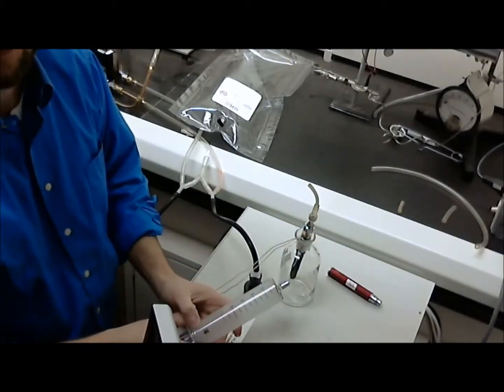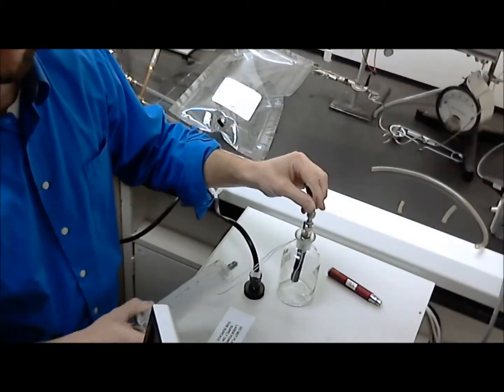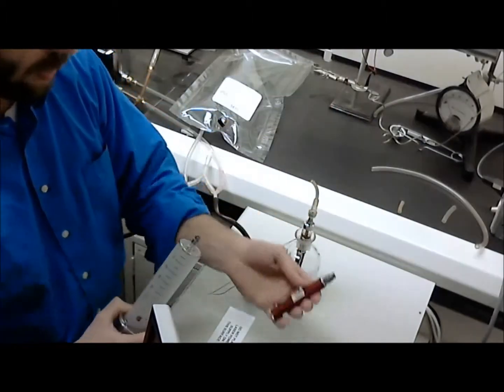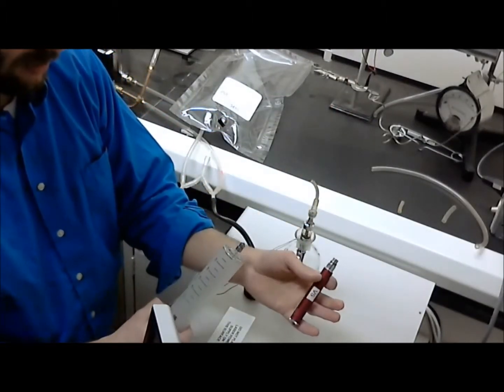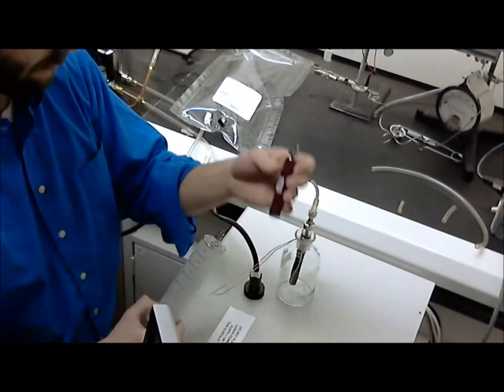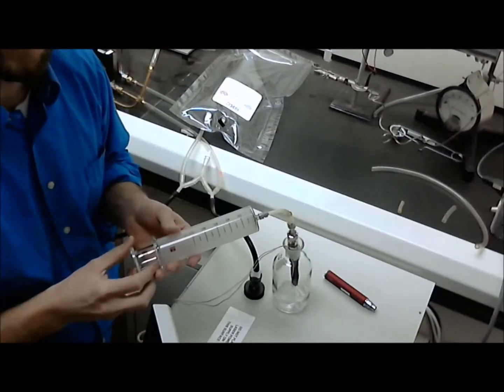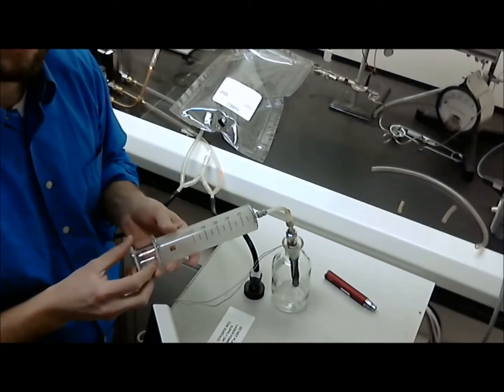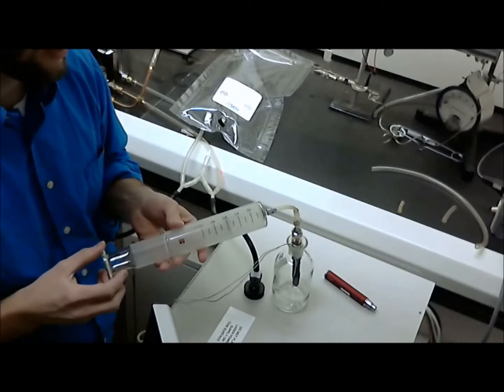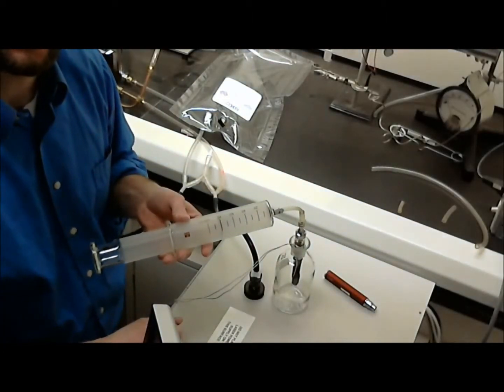A puff was conducted using a 100 cc syringe, and the e-cigarette controlled either by the laboratory power supply and a second researcher, or by this Vision Spinner variable voltage battery controlled by another researcher. The puff was administered manually, with the first 20 cc's being used to establish the correct puff rate, then the next 60 cc's being puffed at 20 cc's per second.